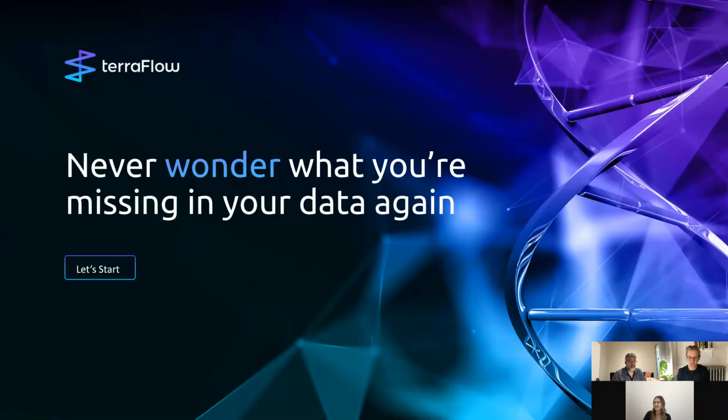Great, thank you. All right, now how do you deal with batch effects? Can you compare data from different instruments, and do you normalize the data? Yeah, thank you so much for asking that. So I mentioned this briefly, but we do handle batch effects, and that is one of the metadata variables you input in the analysis.